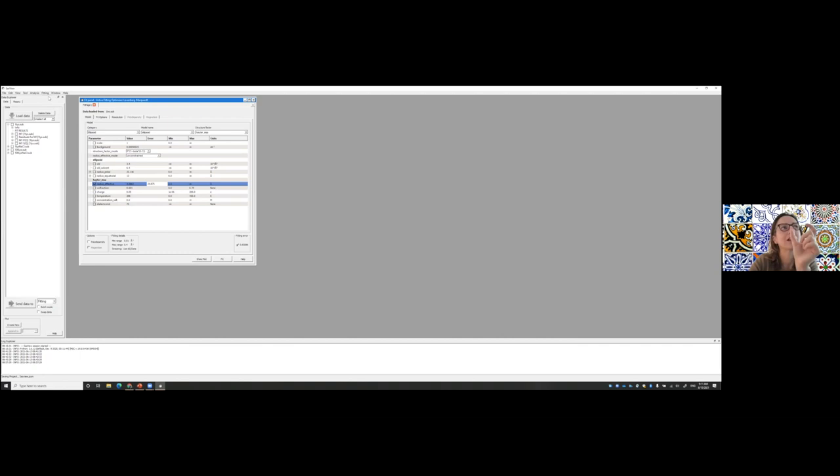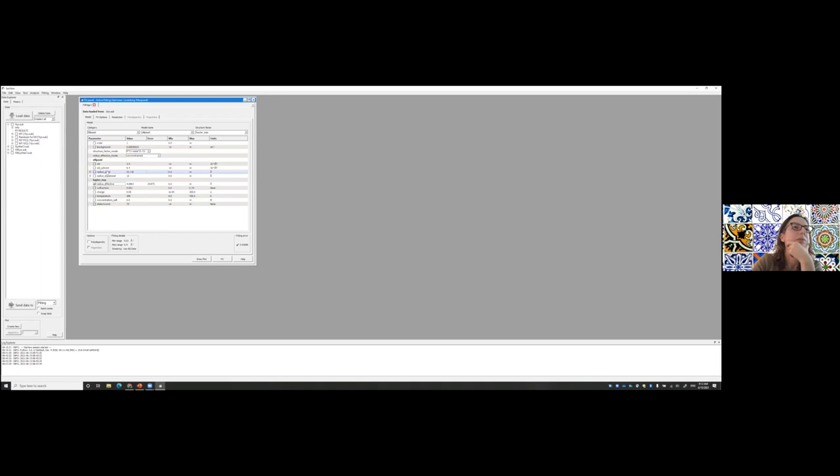Also, we didn't get into it too much, but if you go to the fitting menu, there's an option for constrained or simultaneous fit, where you can define specific constraints that you want for your model. You may have some information from other techniques, or a hypothesis that you want to test. So you can, for example, say, I want the polar radius to be the same for all the samples, but the equatorial radius can vary between two values. You could set that up, introducing those as the conditions that you want.